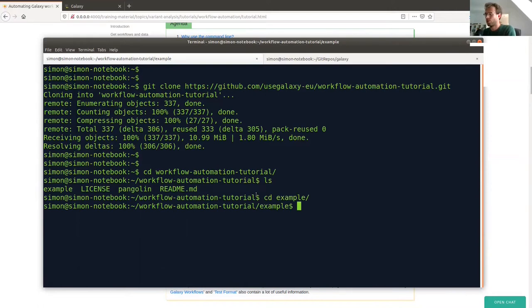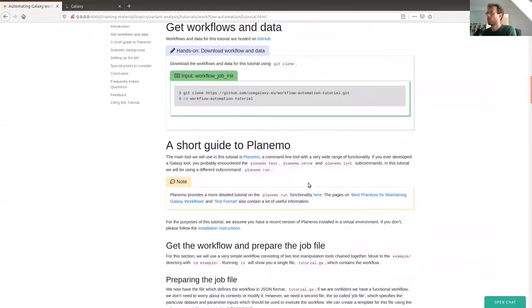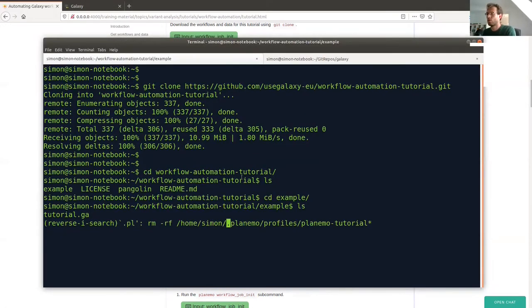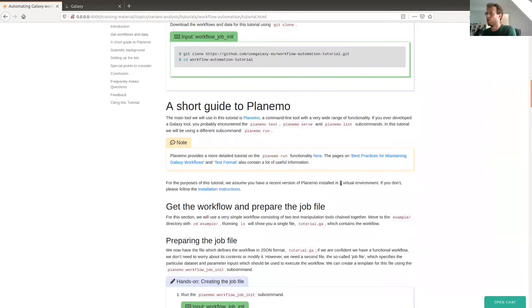I'll show you the example subdirectory first. At the moment it just contains a single file — the tutorial.ga file, which is the Galaxy workflow that is pre-downloaded and provided for this tutorial. The next thing we need to make sure of is that we have a recent version of Planemo installed. It's recommended that you install Planemo into a virtual environment. I've activated my virtual environment — here it is, .planemo. If you haven't installed Planemo yet, there are instructions in the Planemo documentation.